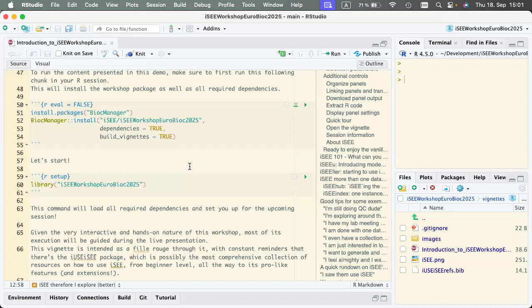Okay, more still scatter plot basically. Feature plot, which would be a scatter plot as well. Yeah, they can be scatter plots that are just cleverly arranged with the aesthetics. Okay, but I think we kind of cover it.